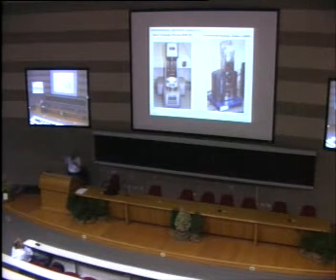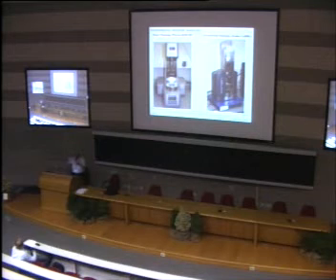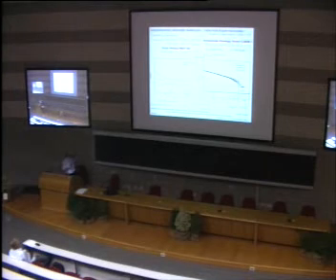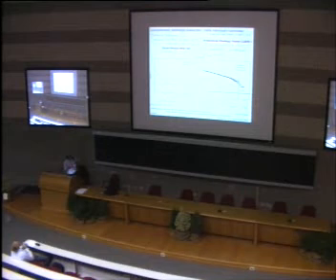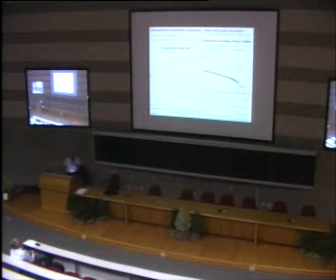It's essentially two plates. You put a sample in between. You suddenly move the plates, and then you follow the evolution of the diameter of a filament, which within certain bounds of operation, this thinning is driven by capillarity and elasticity. And so the slope in a semi-log plot varies as -1/3 lambda, and you take the relaxation time of the largest molecules, which are the longest relaxation times.